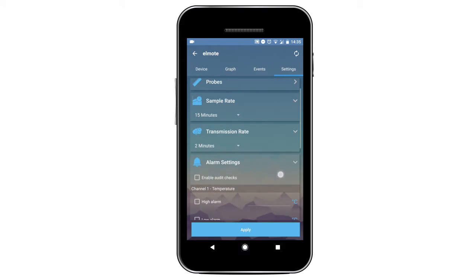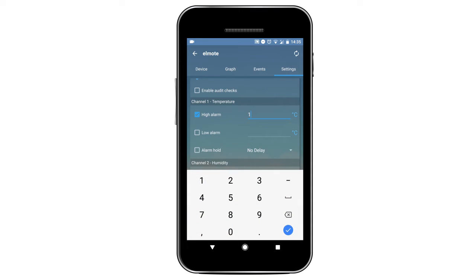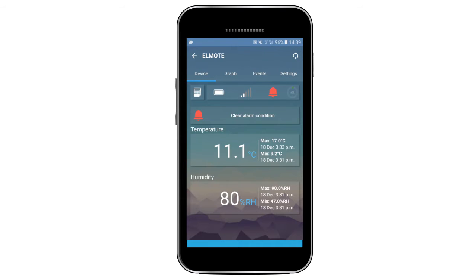In settings, you can set alarms for minimum and maximum limits reached. Alarms will sound on the device, notify you on the app, send push notifications to your phone and alert you on the cloud. You will never miss another alert.